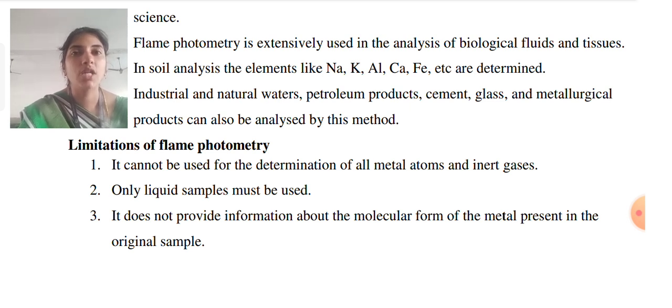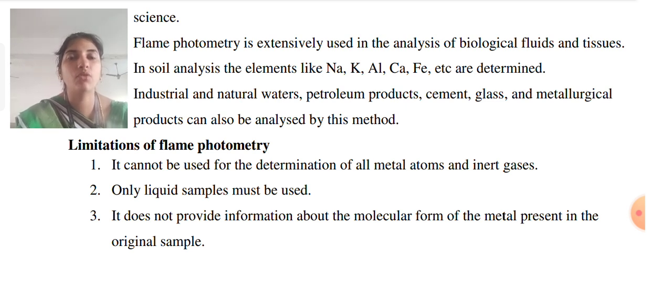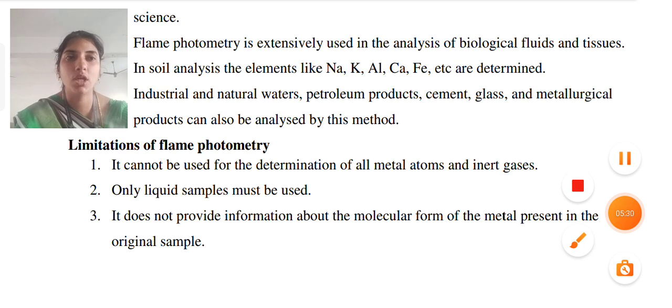So today we have discussed flame photometry, how the flame is emitted for unknown elements, using sodium as the example, and the applications and limitations of flame photometry.